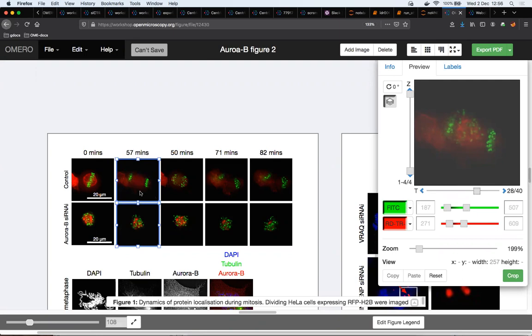And because all the labels are, so to say, live, they are connected via OMERO.figure to OMERO, and OMERO knows what the delta t between the time point planes is, as well as how many time point planes I passed through when scrolling, etc. OMERO.figure can ask OMERO on the fly and change the values as appropriate, both the image displayed in the viewports as well as the corresponding label value. Okay, I hope that you understand now the power of OMERO.figure.